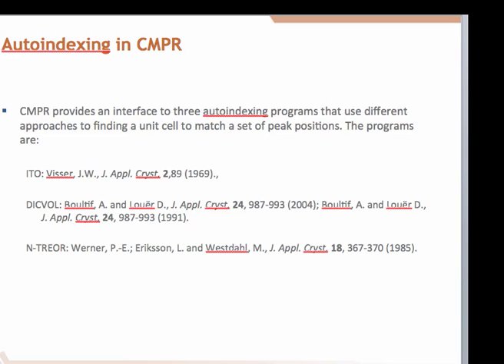Welcome or welcome back. In this segment, I'm going to show how you can run auto-indexing programs using CMPR. Now I should mention to start out with that CMPR is providing an interface to 3 auto-indexing programs, but these programs are not written by me for one thing. These are programs that have been in existence for quite a while and are written by a number of different authors.